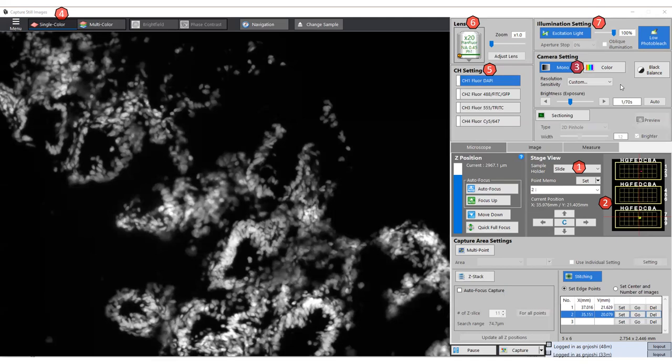Go to your illumination setting. This is where I was talking earlier, which is adjusting imaging parameters is a fun interplay between how much light is coming onto the sample and your exposure. So we will be setting the illumination, which is either you want 100% of the light to go onto your sample, or you can also change this to 70% or 30%.